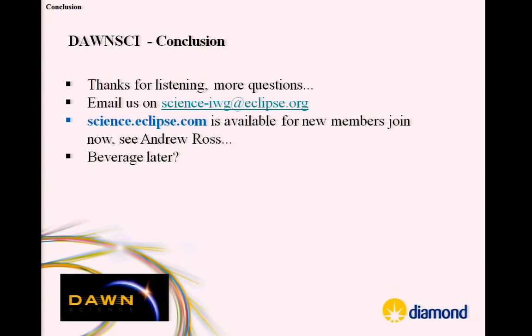And for the IP check, we need to change this. The current library that we use is not supported because it has an LGPL license. And we are searching now for something else. This seems quite nice because I like these graphs and this option of finding peaks, because this is something we also need. Is this somehow the way we should go, or would you say this is way too much for us?